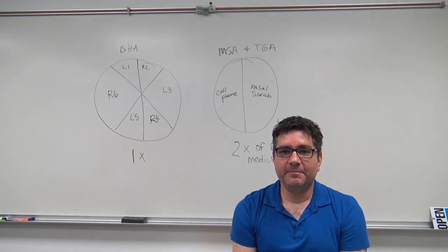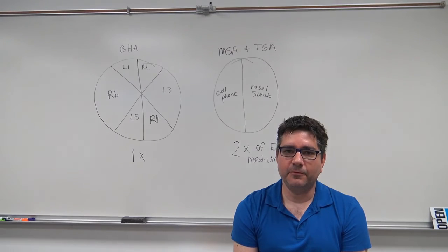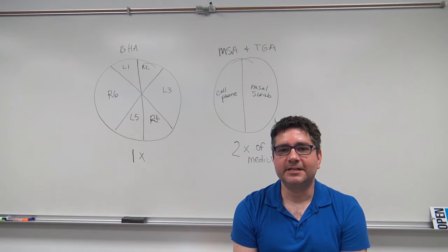These are just a few of the mediums that can select for and differentiate microorganisms. Please take a minute to flip through our book of mediums to see what else is out there.